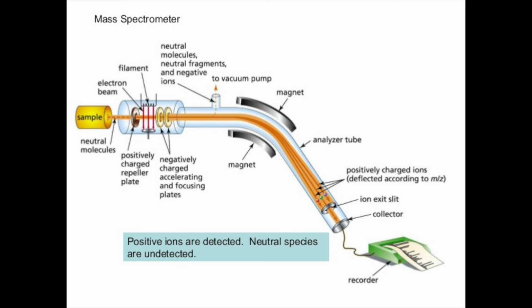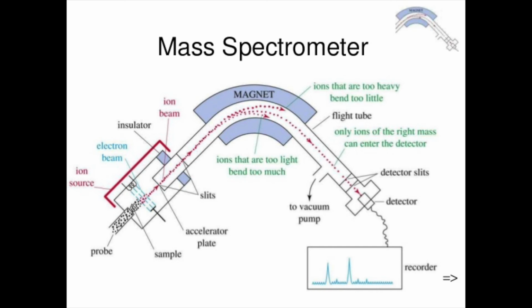In a typical mass spectrometry procedure, a sample, which may be solid, liquid, or gas, is ionized by bombarding it with electrons. This may cause some of the sample's molecules to break into charged fragments. Those ions are then separated according to their mass-to-charge ratio. The ions are detected by a mechanism capable of detecting such charged particles.